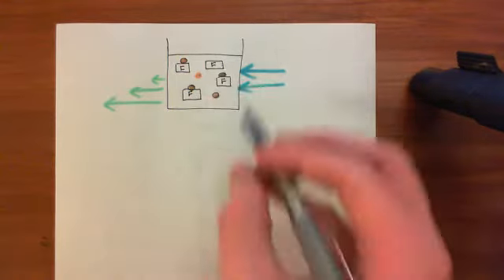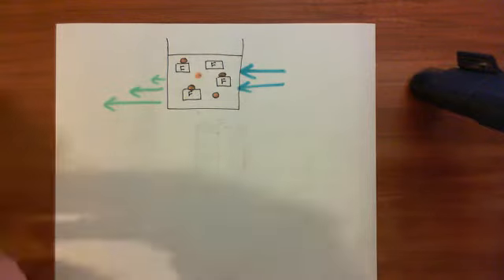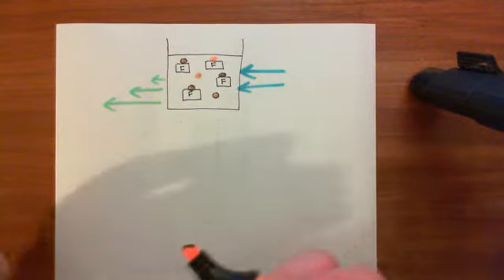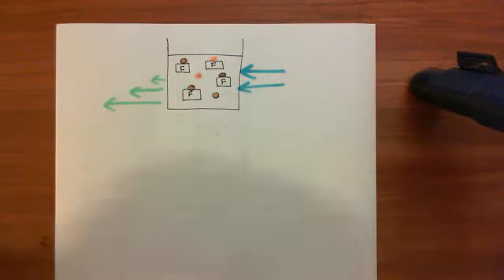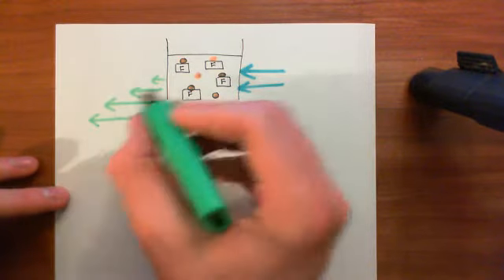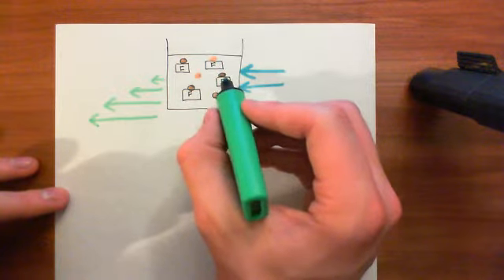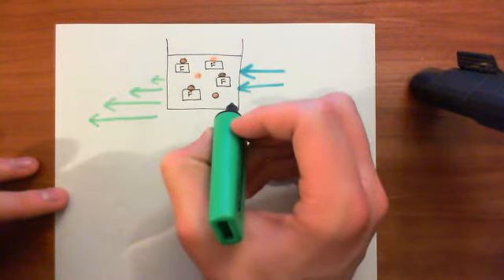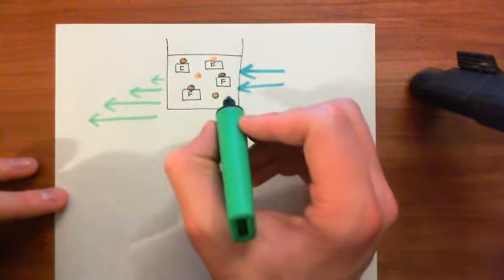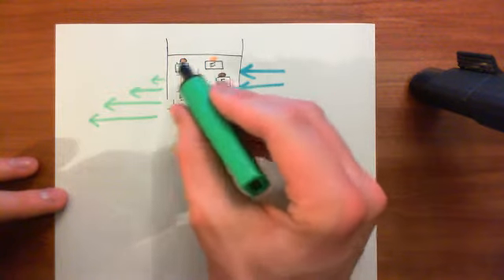And then we could take this even further and get more and more Fluo-4 molecules bound. Eventually, of course, we'll saturate it. We'll get to the point where pretty much all of the Fluo-4 molecules are bound to calcium, and then you can't get any higher. But the genius thing is that with the concentrations of calcium inside the cytoplasm of cells, you don't saturate your Fluo-4. Your Fluo-4 molecules will not all be bound to calcium with the concentrations that are inside cells, which means that we can look at this.